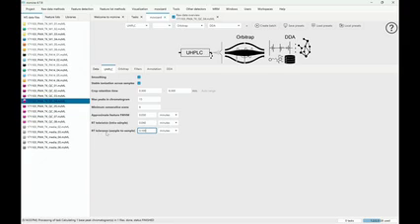Then the retention time tolerance sample to sample is important for the alignment. It very much depends. Did you run it in one batch? Maybe you ran it across 2 years, 2 batches, and the column is different, like a new column at least. So this is a very important thing that you have to optimize, especially in multiple batches.